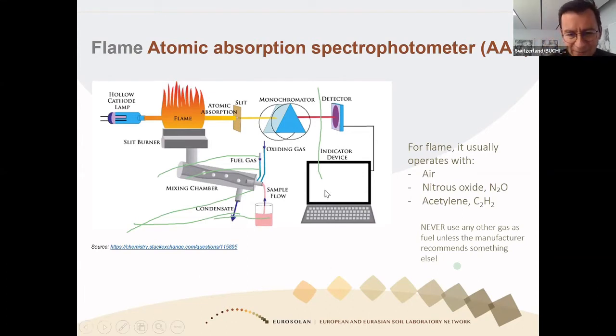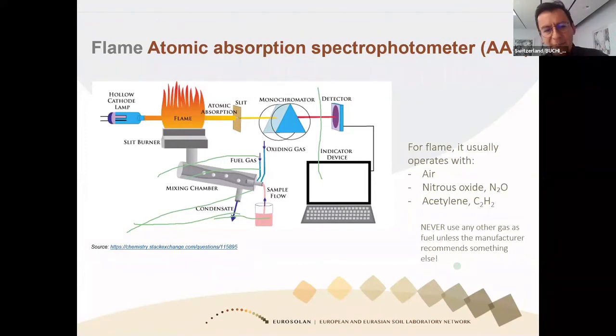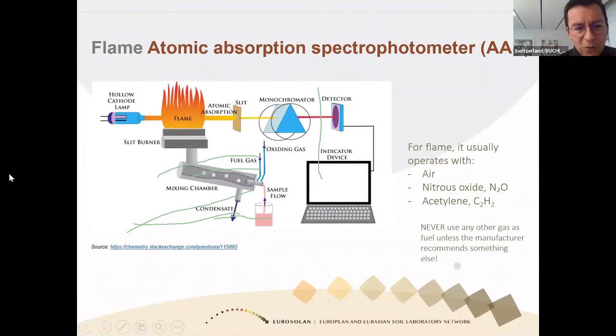If you look at this slide, imagine that this pink solution is the solution in which you have all the calcium that you want to analyze from that sample. The sample is transported to this mixing chamber, where you mix the fuel gas with an oxidizing gas, and then you burn the sample, and the sample goes to this flame. In this flame, all the components of the sample are there. Then you use a lamp to illuminate that flame, and based on the composition of the atoms in that flame, some energy will be absorbed by those atoms, and the energy that is not absorbed will be transmitted.